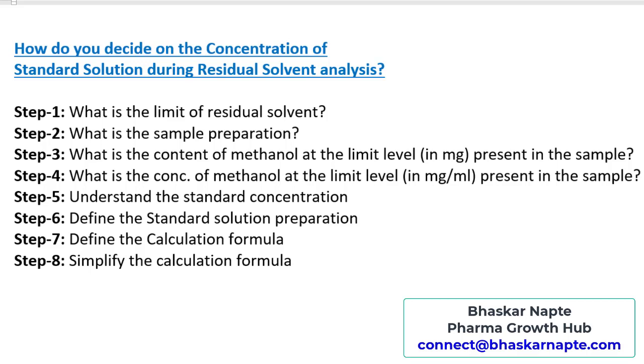Now, when we realize that there is a great need to have the external standard during quantification, the next obvious question is how one can define the concentration of the standard solution. In this video, I am going to explain how one can decide on the concentration of standard solution during a residual solvent analysis. You can also relate this knowledge to defining the standard concentration during related substances analysis too.